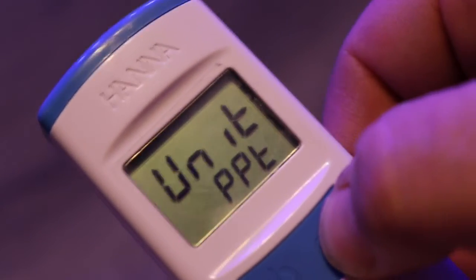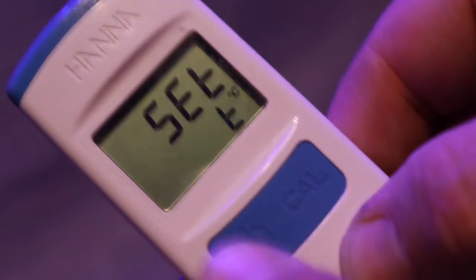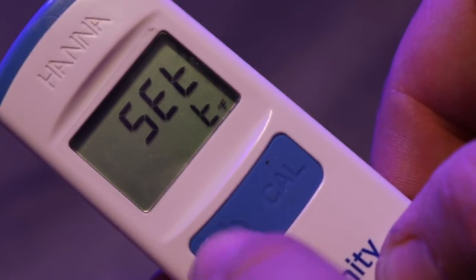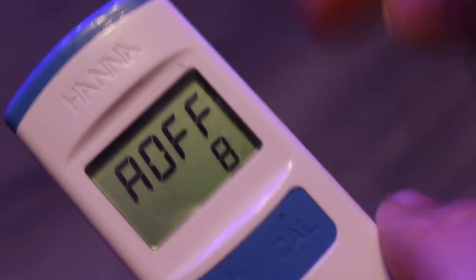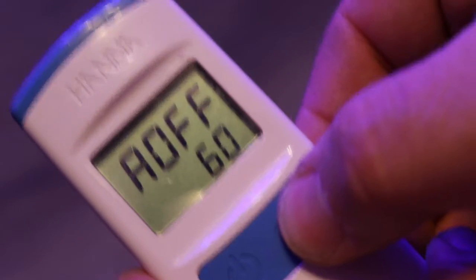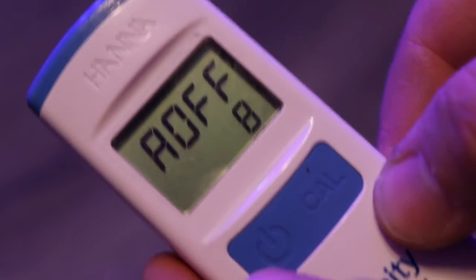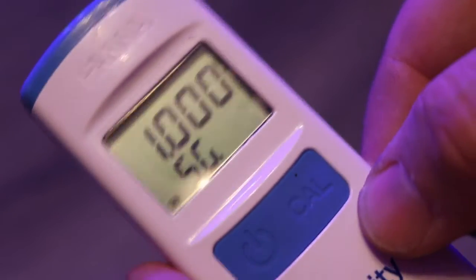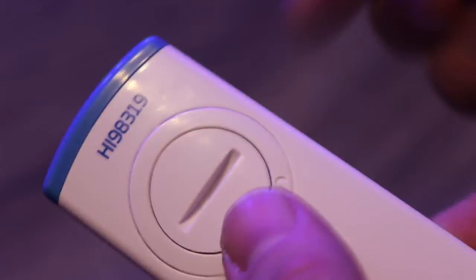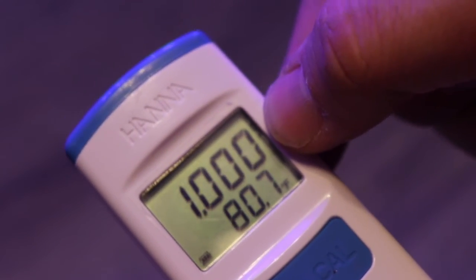Currently measuring parts per thousand, we want specific gravity. Once we've reached the unit we want, hit the power button. Now it asks to set the temperature — Celsius or Fahrenheit? We want Fahrenheit, so hit the power button. Next is the auto-off option: you can choose between 8 minutes, 60 minutes, or disabling auto-off entirely. We want 8 minutes, so hit the power button. After reinstalling the battery door and locking it, we're now measuring in Fahrenheit and specific gravity.